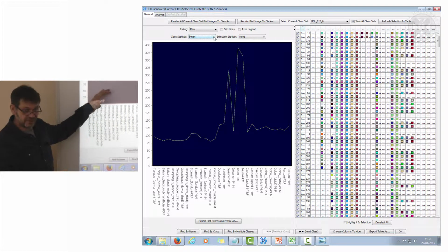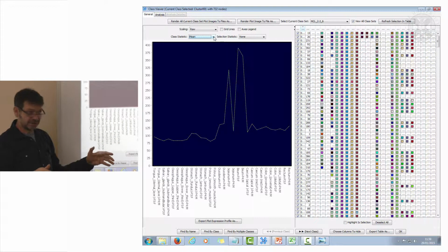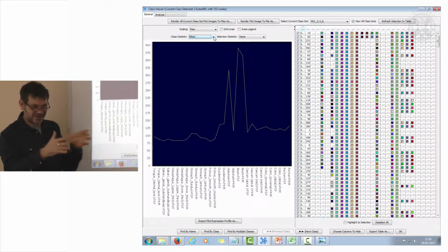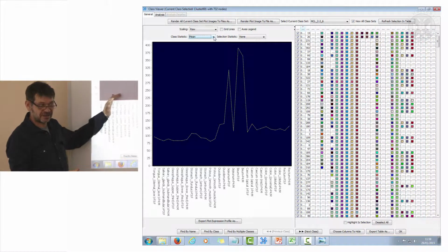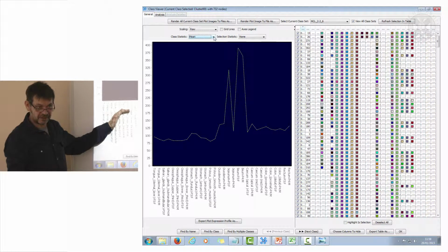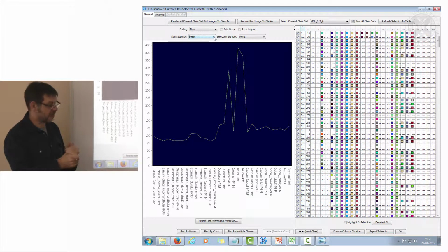So what you're going to be doing when you're looking at data is pattern staring. You're going, how do I understand this? You're trying to relate what it is that you thought you'd done relative to the patterns of data that you see before you. Okay, that's generally, you've got to believe your data after all, and that allows you to do that.